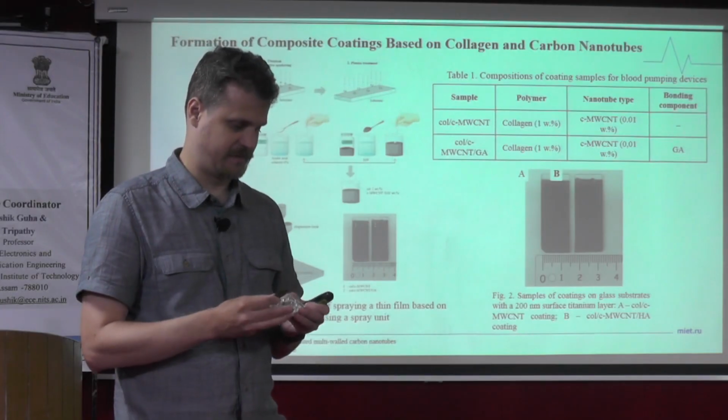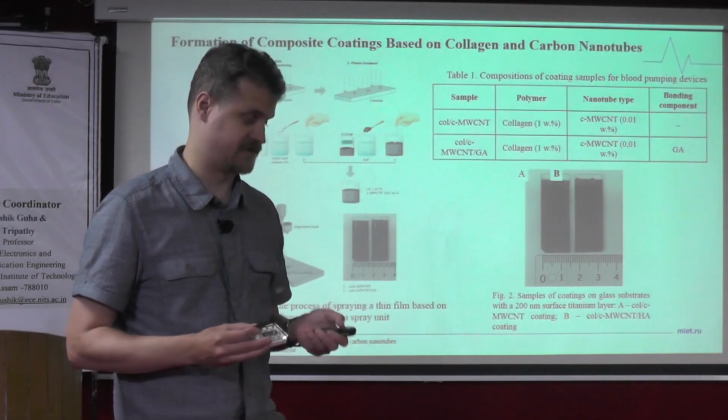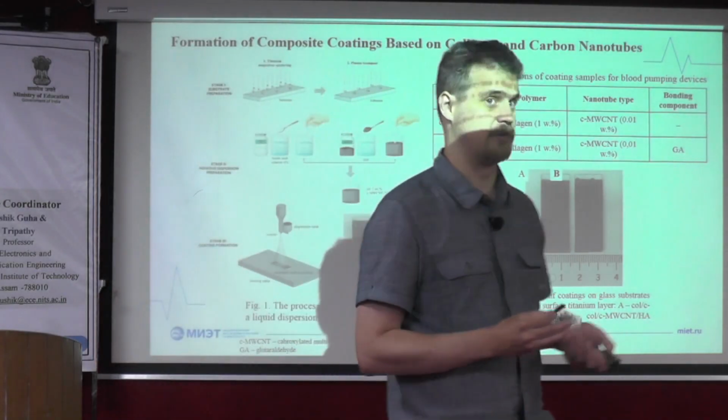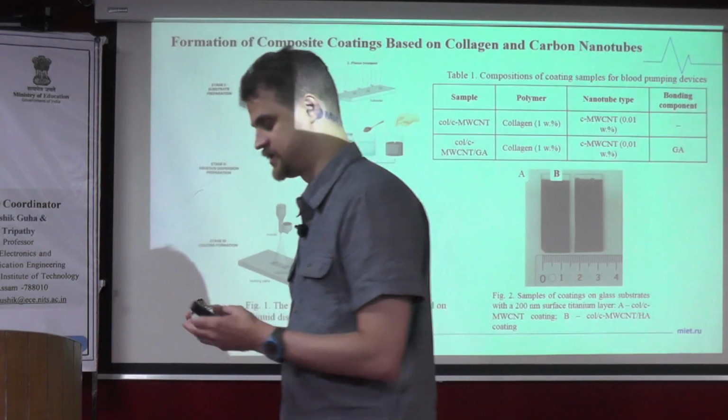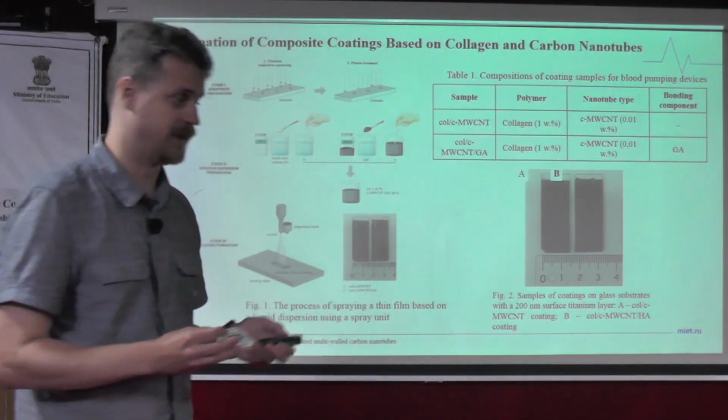That means that the microfluidic system that is created for the purposes of heart improvement could potentially be used for the formation of microfluidic systems that can address the problem of blood clotting.